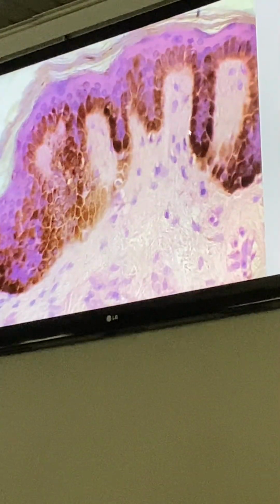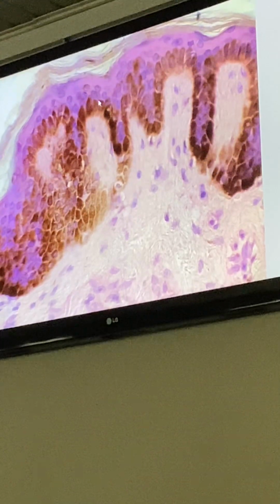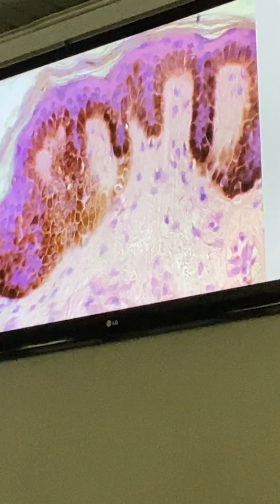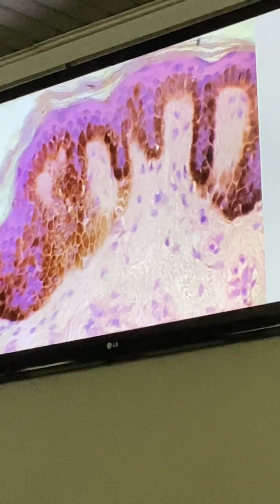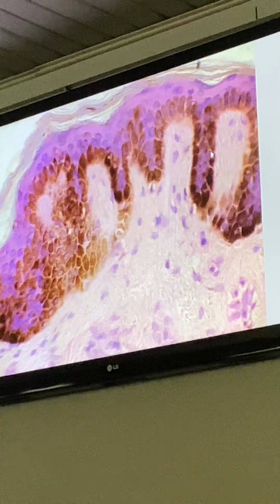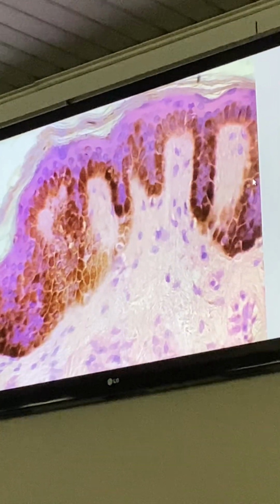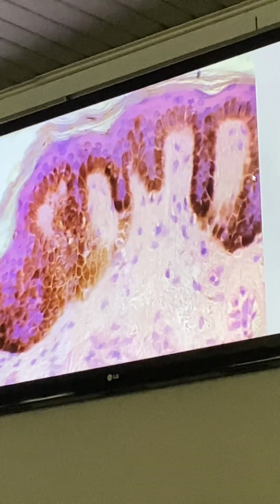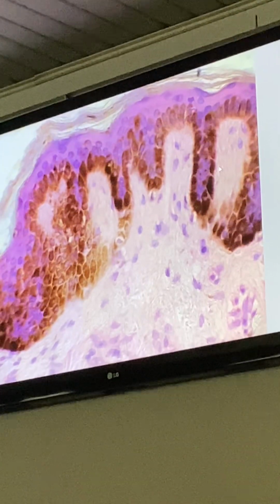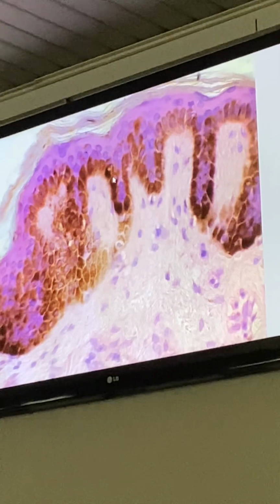Okay. This is the brown color. This is melanocyte, rounded cells found between and among the basal cells. They have melanin pigment. In this slide, you need to know just these cells. The brown color, this melanocyte cell with melanin pigment.